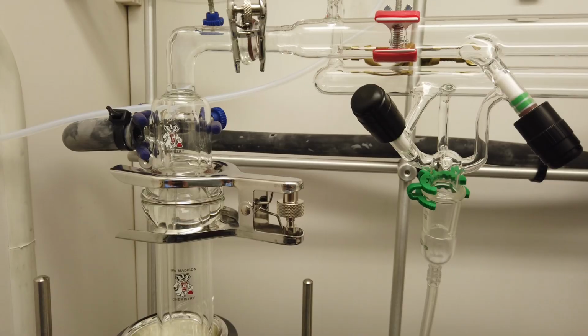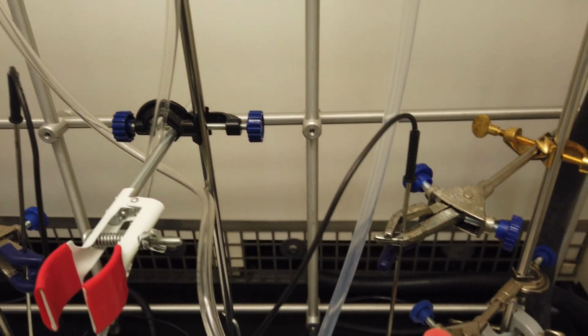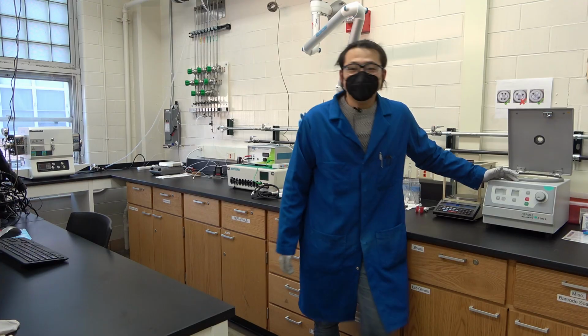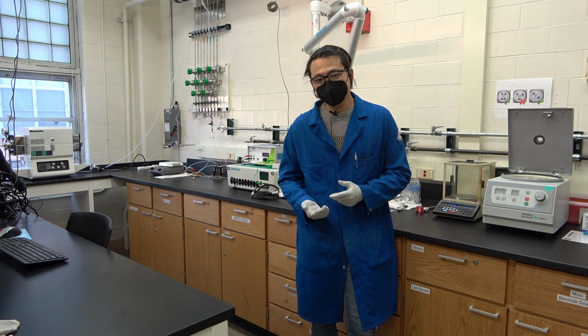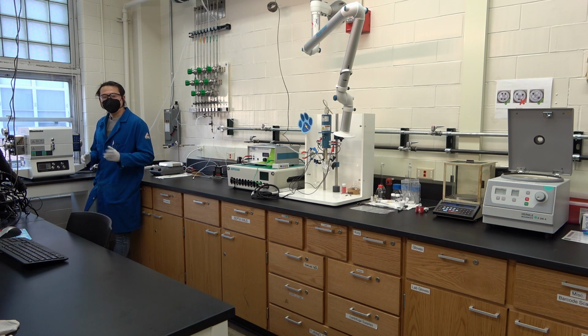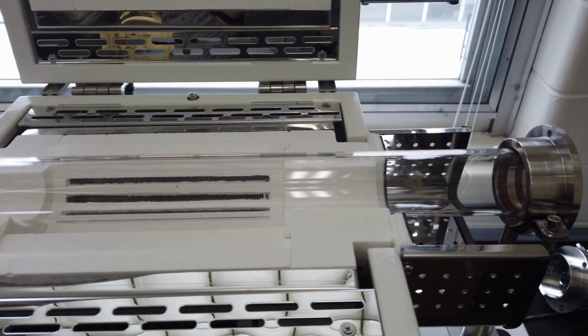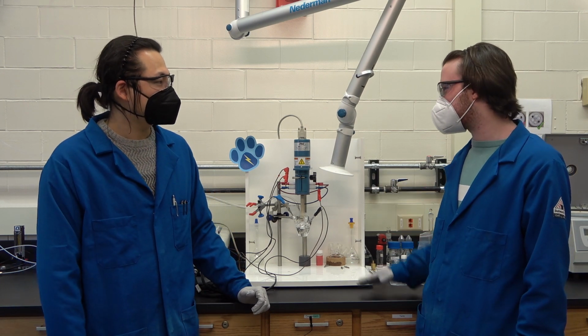Well, the most important thing of all to make nanoparticles is to avoid them from oxidizing. With these Schlenk lines, I can make these particles in inert gas. After the particle synthesis, I use this centrifuge to separate the particles from the solution and for further purification. For electrochemical studies, it is very important to keep the surface clean. And so we use this tube furnace to remove any source of surfactant that was used before we do an electrochemical study.